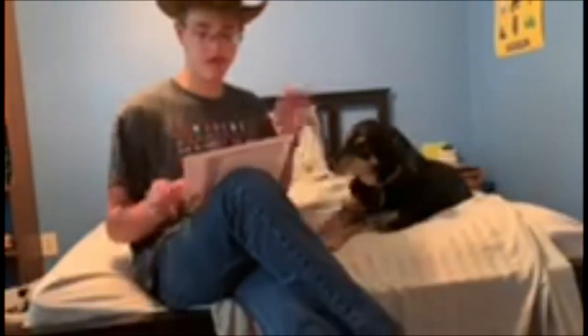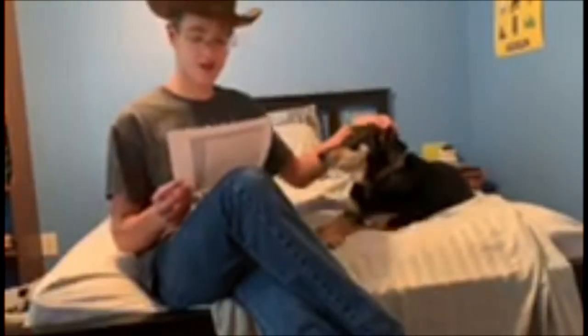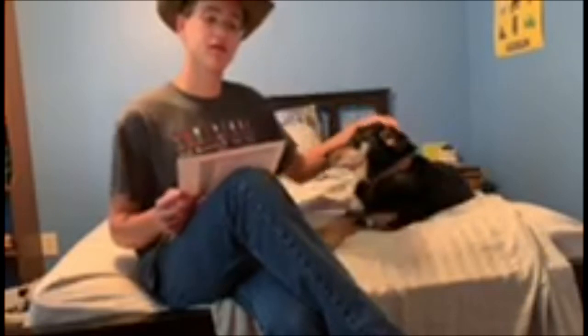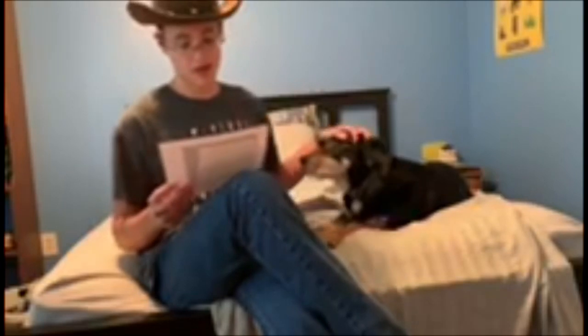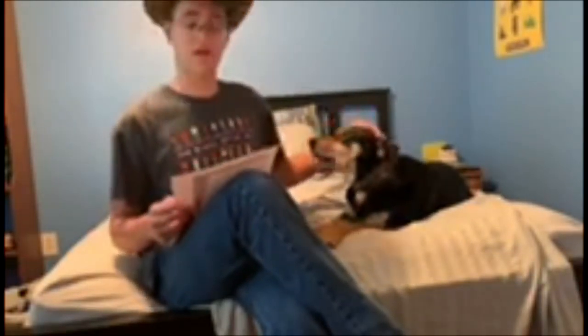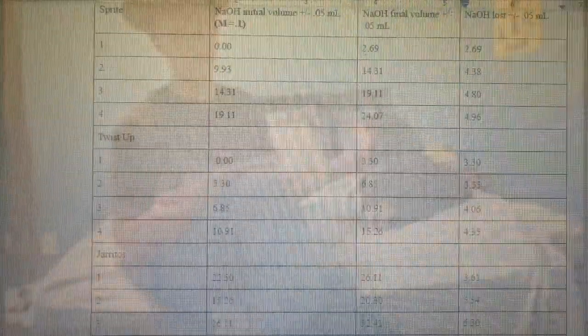Here's the conclusion of the thrilling story that you've had to watch. So in this experiment, the purpose was to find out how Sprite's citric acid compared with the concentration of other sodas that also contain citric acid. Our hypothesis was, if sodium hydroxide, NaOH, is added to other lemon lime sodas, then it will be found out that the knockoffs will have a lower concentration of the citric acid than Sprite.